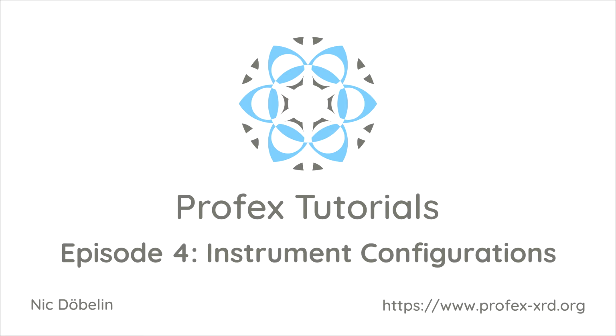In this episode I'm going to demonstrate how we can create Profex instrument configuration files for our own instrument setups. This is often the first major hurdle to overcome for new users because a lot of detailed information on the hardware setup is required. So let me guide you through this process step by step.